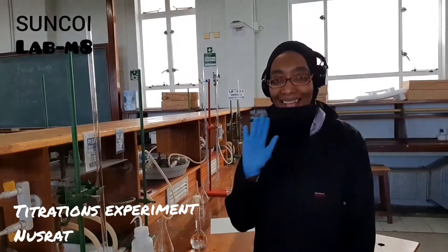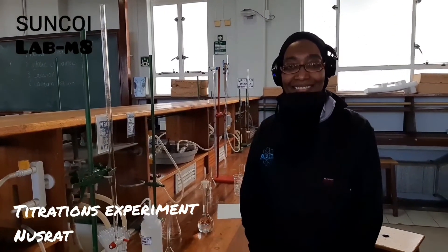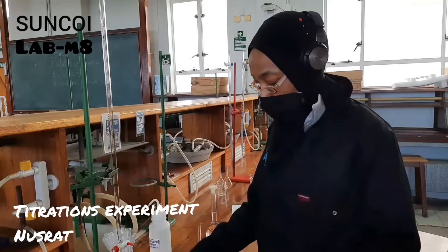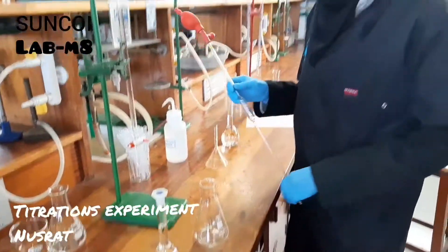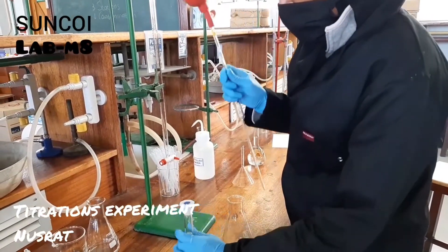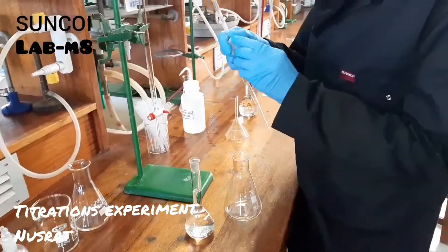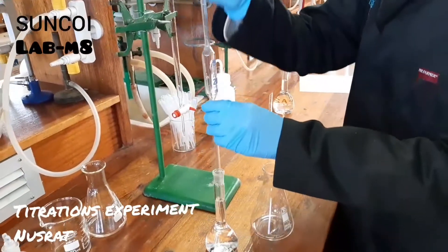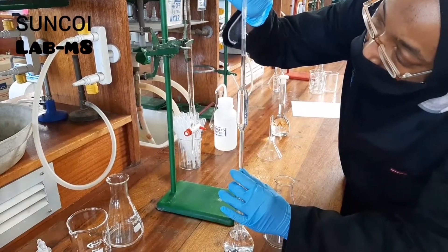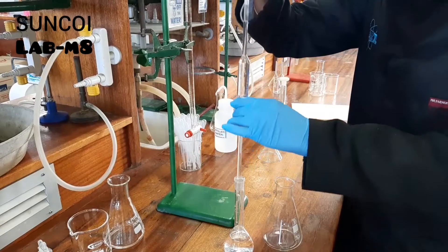Hi guys, welcome to another installment of Lab Mates. Today your lab mate is Nusrat, and Nusrat is going to show you your titration experiment. As mentioned in the intro, for titrations you are going to titrate NaOH against a standard known solution of oxalic acid, and the aim is to calculate what the concentration of the unknown sodium hydroxide solution is.